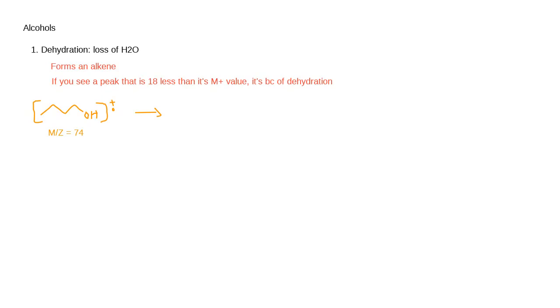And I'm trying to get to a mass spec that is 56. Now when we do the math, 74 minus 56 equals 18, right? And 18 isn't one of those numbers I showed you on the previous page. It's not a perfect methyl group. It's too little for ethyl. So it cannot be just carbons and hydrogens.